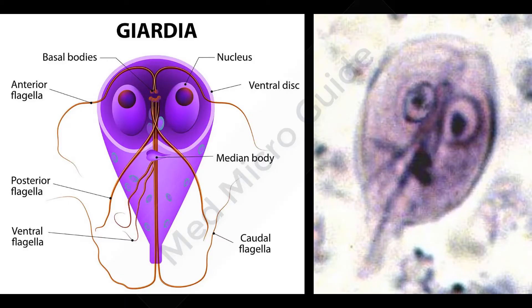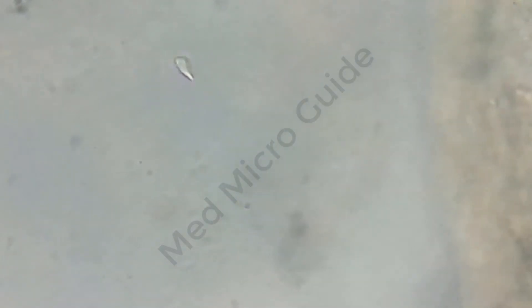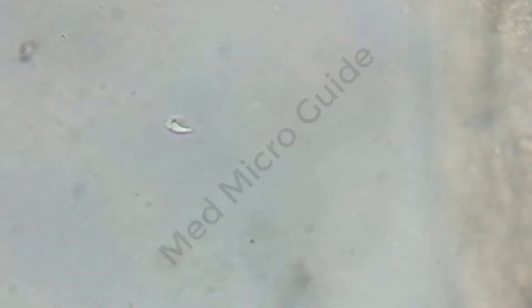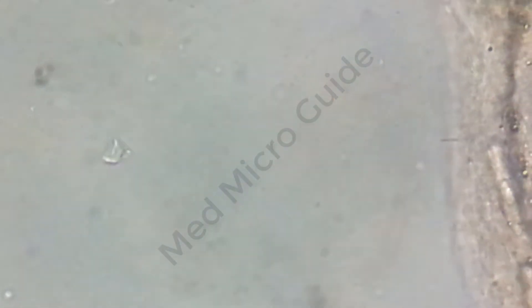The trophozoites of Giardia lamblia are pear-shaped with a ventral disc and four pairs of flagella. Under 40x magnification, we can see the clear falling leaf-like motility of Giardia lamblia. You can observe the shape of the organism — it looks a little bit pear-shaped or sickle-shell shaped, and with the help of those four flagella, the parasite moves in different directions, which is similar to the falling leaf.